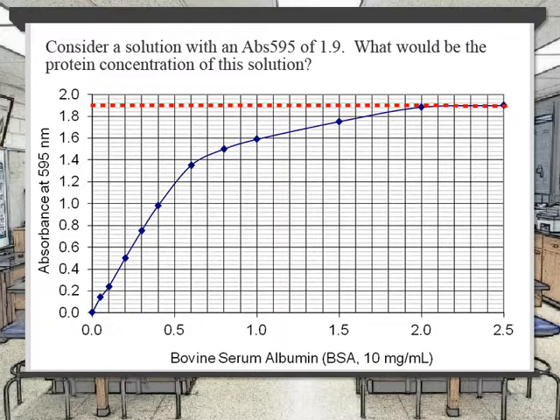This makes it difficult to determine exactly where 1.9 would fall on the curve. In other words, we do not know where that point could be. We want to go ahead and establish what range of dilution of that sample we wish to make, so that we can be sure that we will obtain at least one of them that has a value that falls within that area of the region to predict the concentration in an unknown solution.